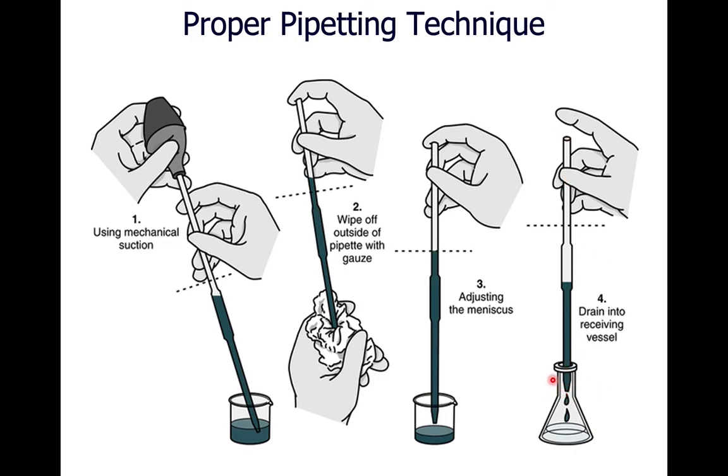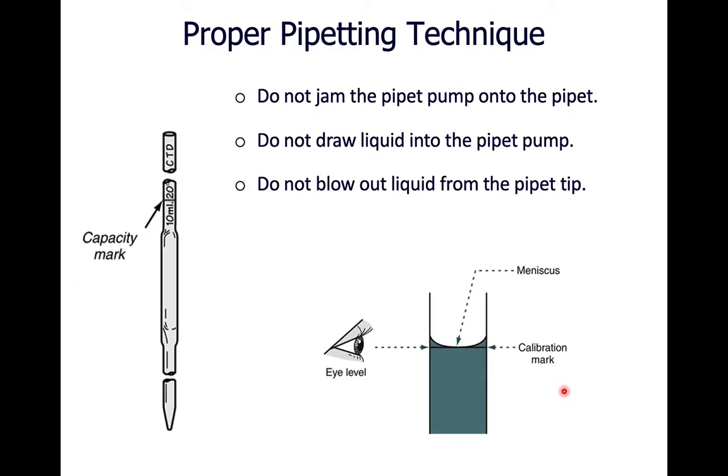You want to let it drip out all the way, but not to push. These are designed to retain about one drop in the end. You don't want to use your finger to try to tap and make that drop come through or anything like that. You just want it to naturally drain and then leave about one drop in the tip, and that's how it's designed to be.